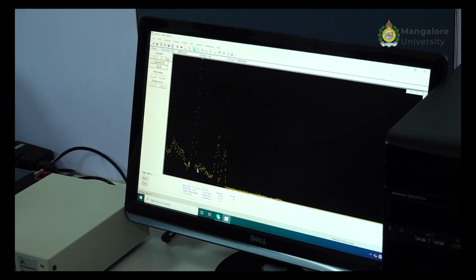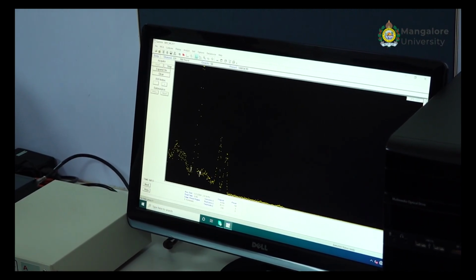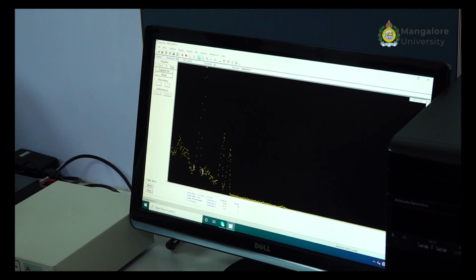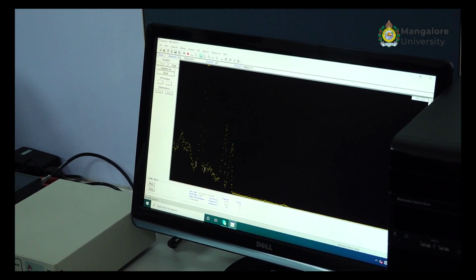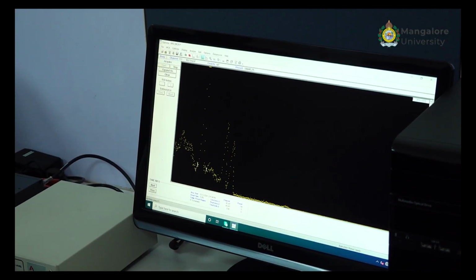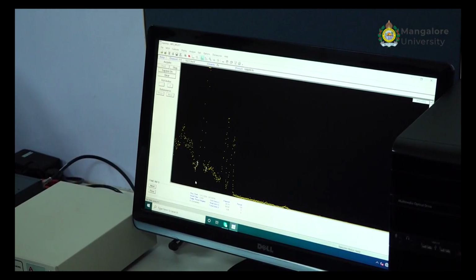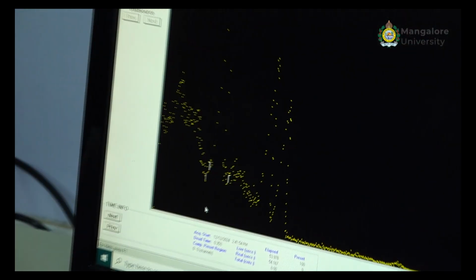This is the control R. So you see the channels. This energy over here is what? 785. And this energy over here, at the other end of the spectrum, is 552. So between that, if you get any other peak, it will merge with the peak.